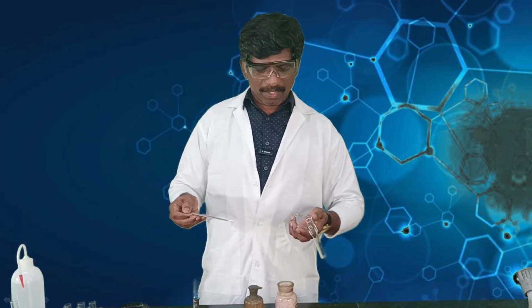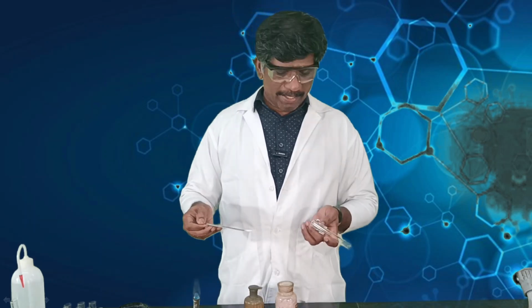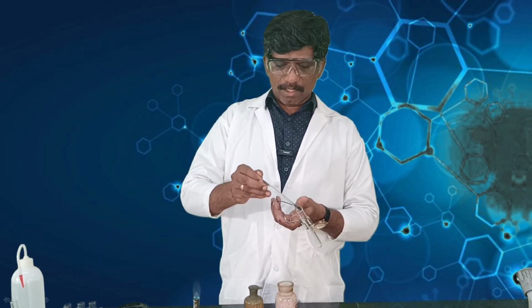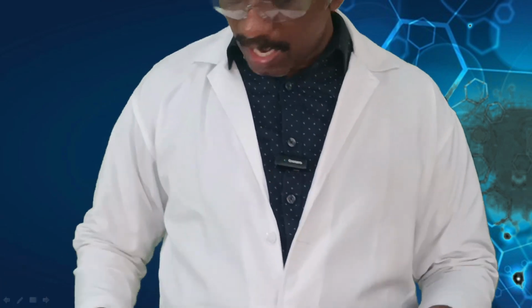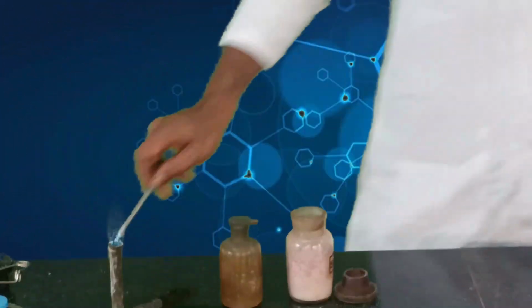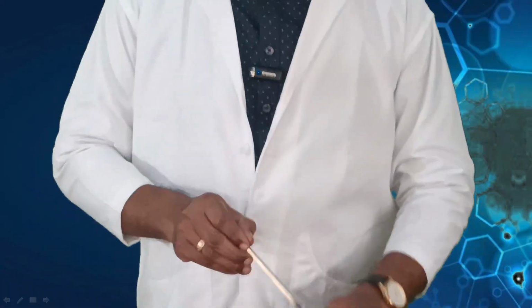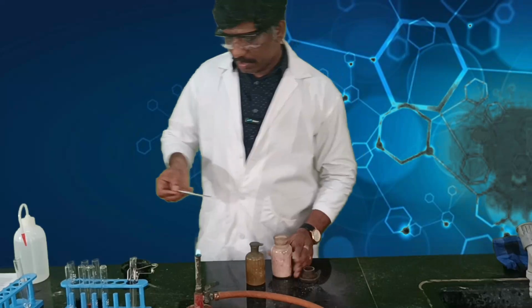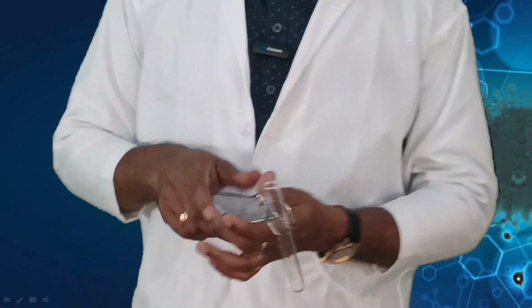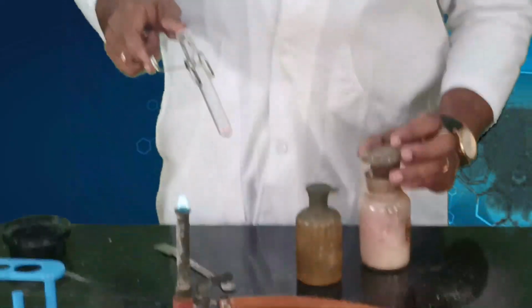Now we shall see the test to detect amides. In order to do that, take your substance, add a little bit of sodium soda lime. Take a little bit of soda lime and then heat.